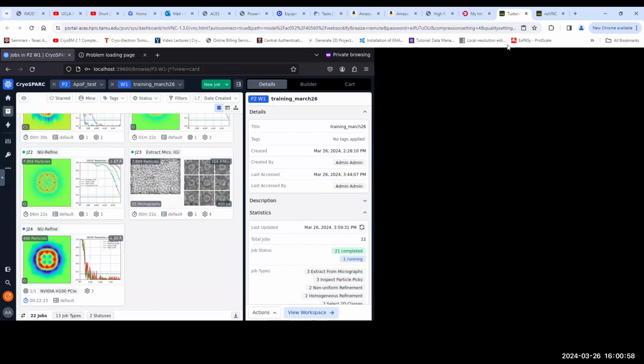Yeah, but if you're working and it's 10 o'clock and you run your job, obviously you're not going to get up at 3 in the morning and check your job and see if it stops. If it's done, you just check it the next morning. And also, if you're working on something and you see the processing is taking longer than the maximum queue time, which is 2 days for the GPU queue, then you can request an extension for that job.